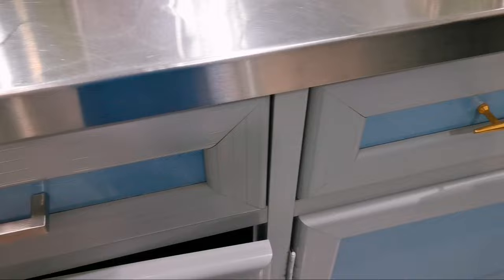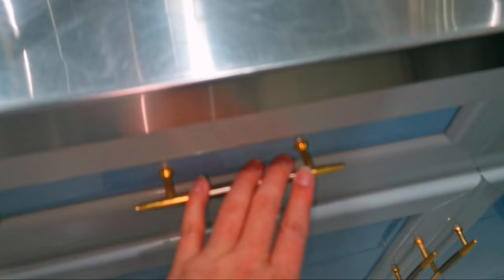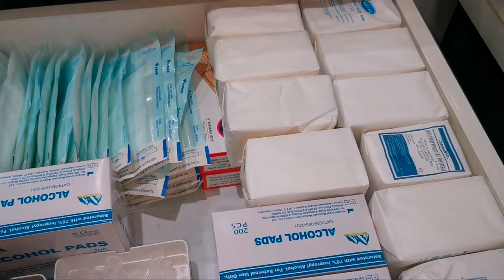Then inside the cabinet we have the urine and stool containers. We also have the alcohol pads and plaster, and on the other side we also have sterilized gauze.